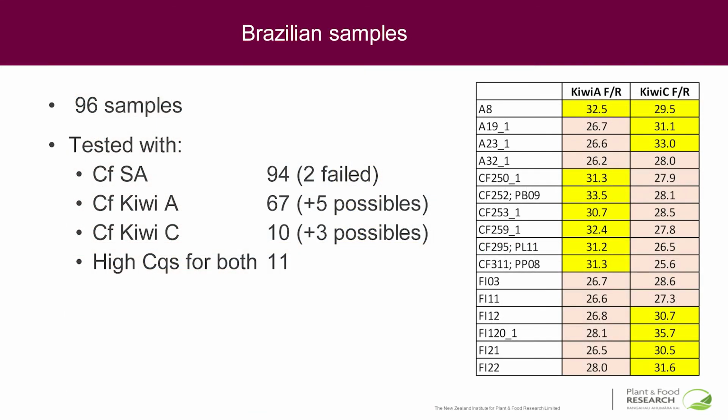Okay, and in terms of the Brazilian isolates that we got, we're very grateful. We got 96 samples that were sent over. Now, of those, we got, I say, 94, and two failed. Well, we actually know why they failed. There were actually bubbles in the mix.